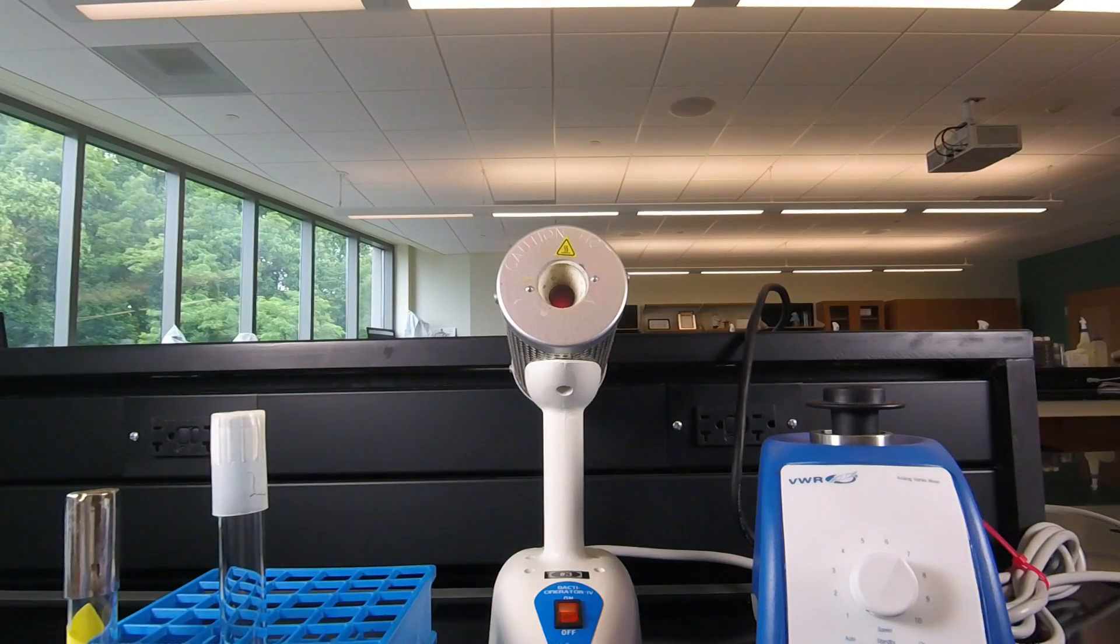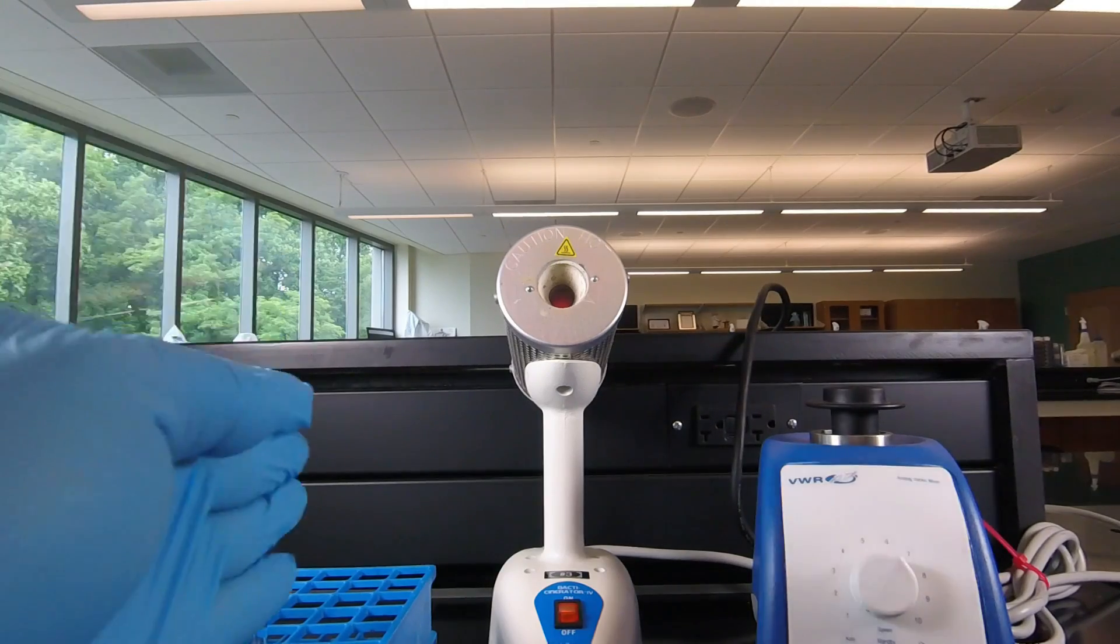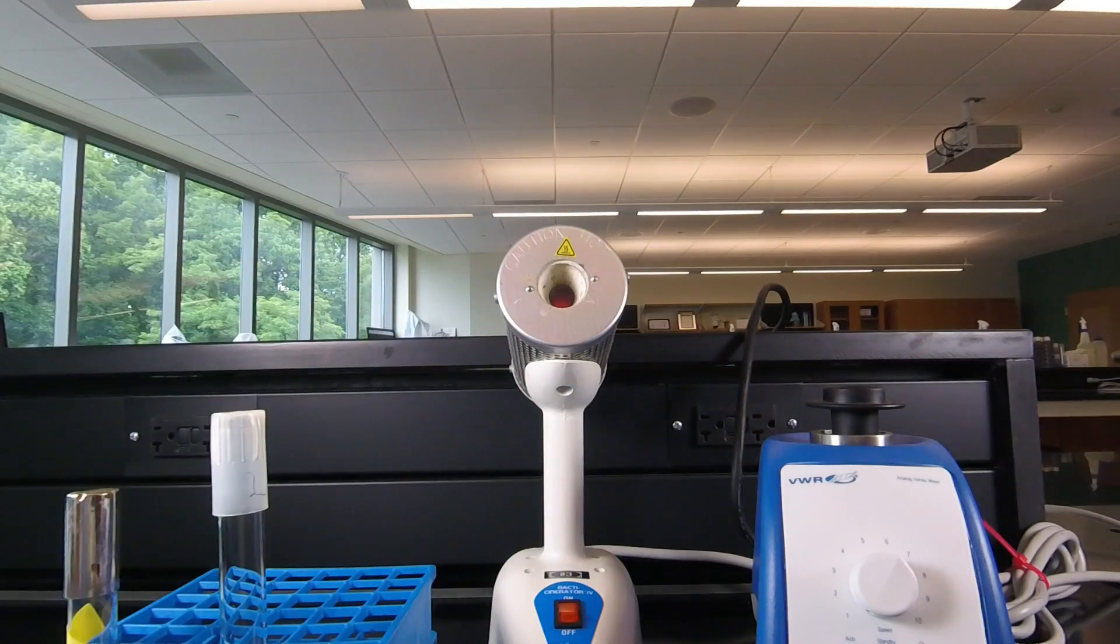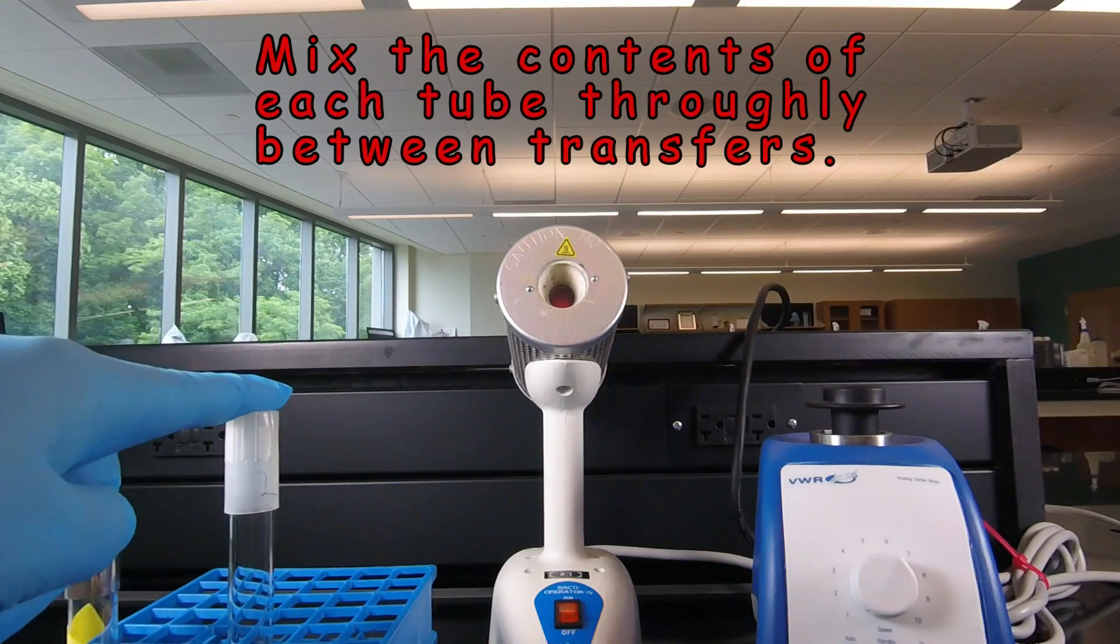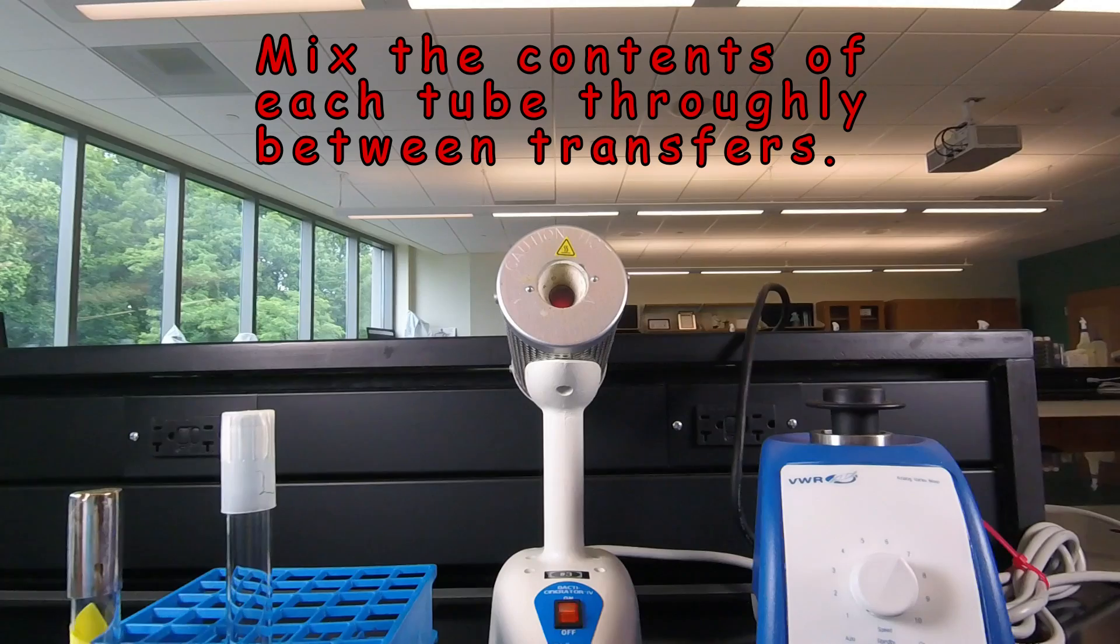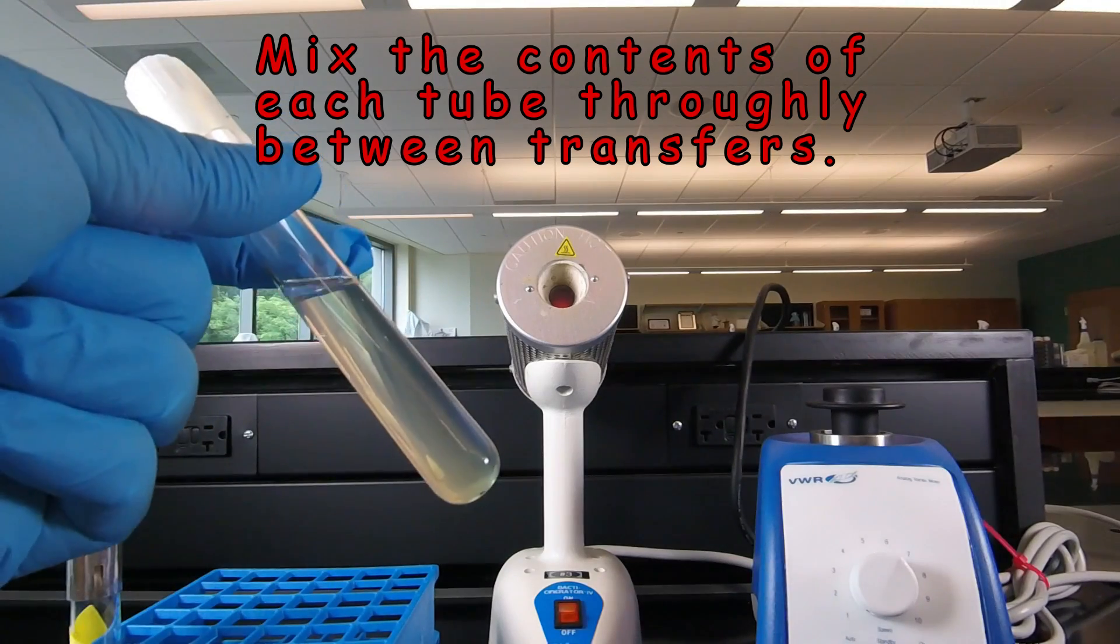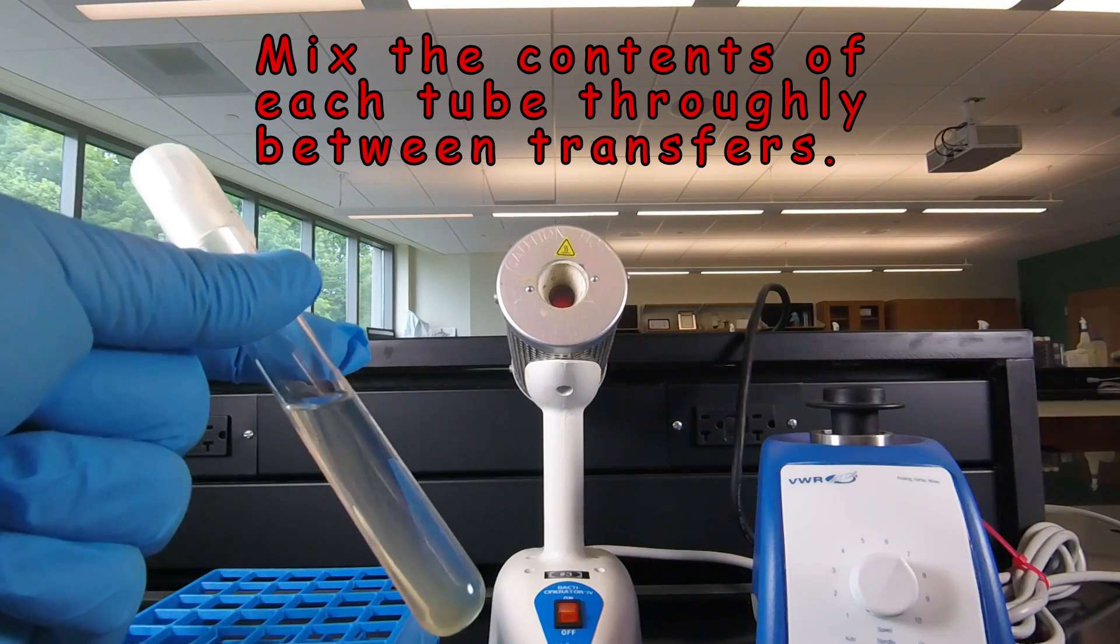Now you're going to be doing a serial dilution during lab where we're going to be transferring bacteria from tube to tube to tube. And so it's very important whenever we get ready to remove bacterium from one tube and put it into the next tube that we mix the bacteria up thoroughly so they're evenly distributed.